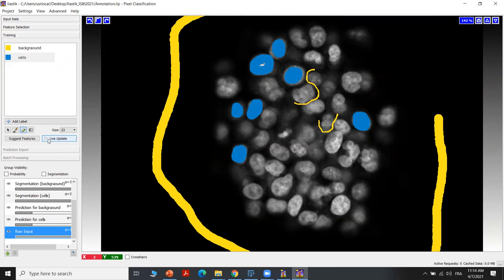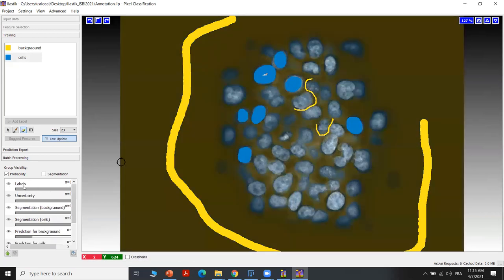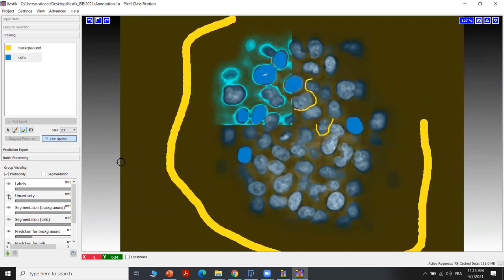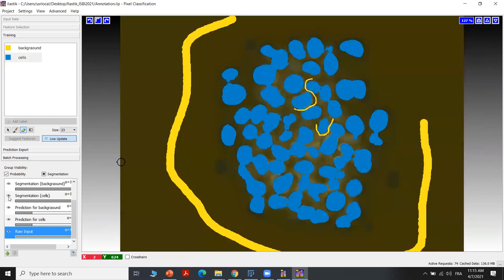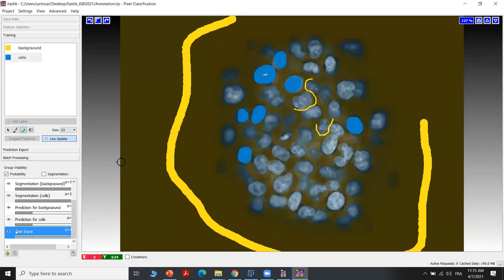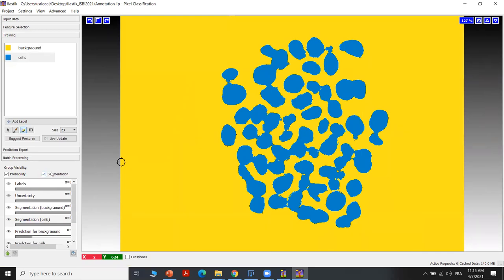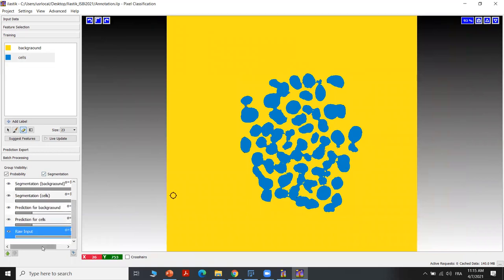After that, we can click on 'live update' to start the training of the model based on the annotation we did and to see the result. In this small window, we can see different options: we have the labels, we can activate or deactivate their visualization, we can see the uncertainty of the model, the segmentation map of the background only, the segmentation of the cells, the prediction, and the raw input. Let's stop the live update and check the result of the segmentation.